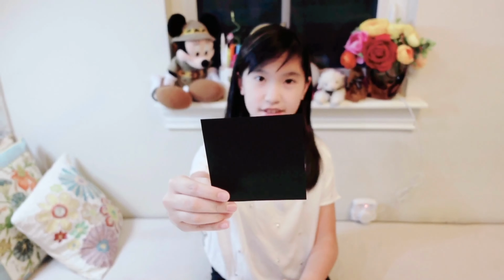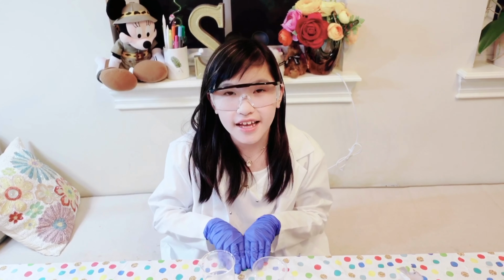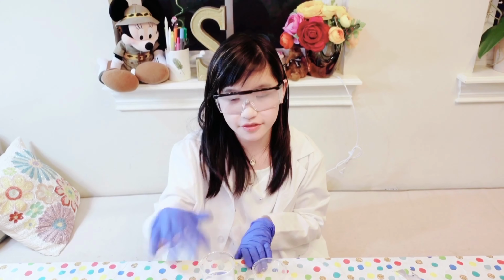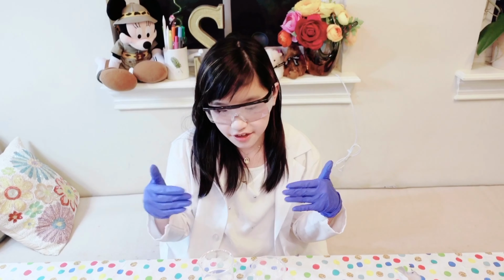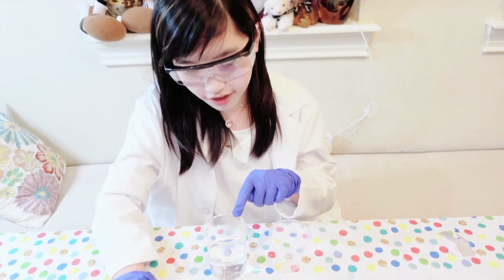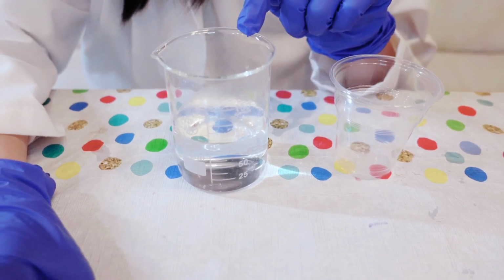Okay, let's put our safety gear on. Since safety is important and some of these chemicals are hazardous, we have to put on safety gear. I asked my parents to boil 100 ml, and please ask your parents to boil it.